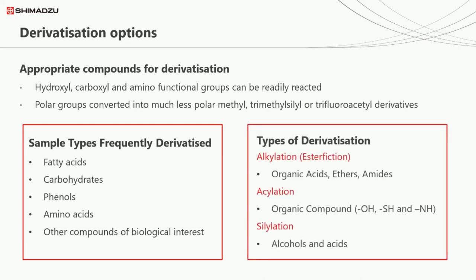Ultimately, derivatization can significantly improve GC methods and make previously difficult samples easy to work with. It also, however, adds more time, labour, and opportunity for error. Think carefully and weigh up the pros and cons of taking this approach.